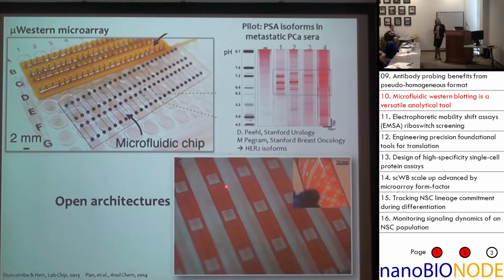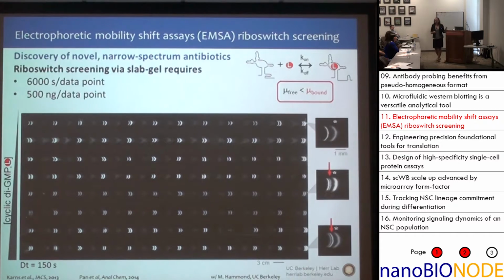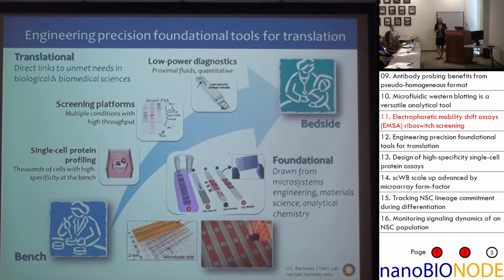And so what you're looking at here is polyacrylamide gel, so that separation matrix, but we've used light to be able to photo pattern little injector wells and different geometries on these devices, which has allowed us to do high-scale screening of conformation changes in a different assay that I won't talk about today. Okay, so that's kind of the story about how, as engineers and separation scientists, we've developed these tools, tried to understand really what the needs are, and then gone through an iterative process to get to the point where we're able to get the performance that we want.